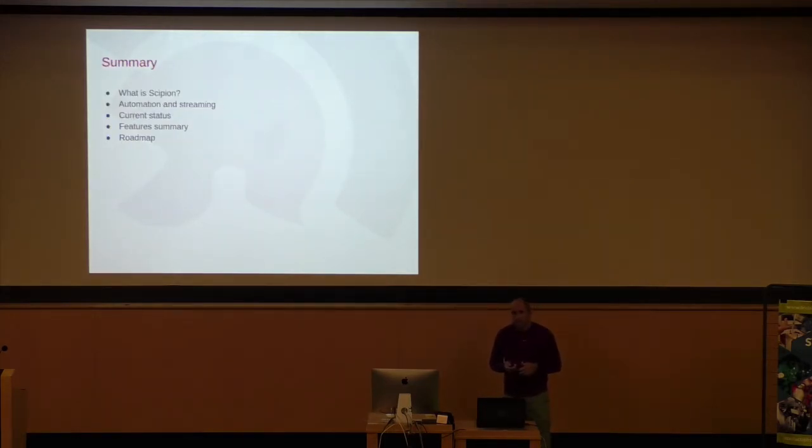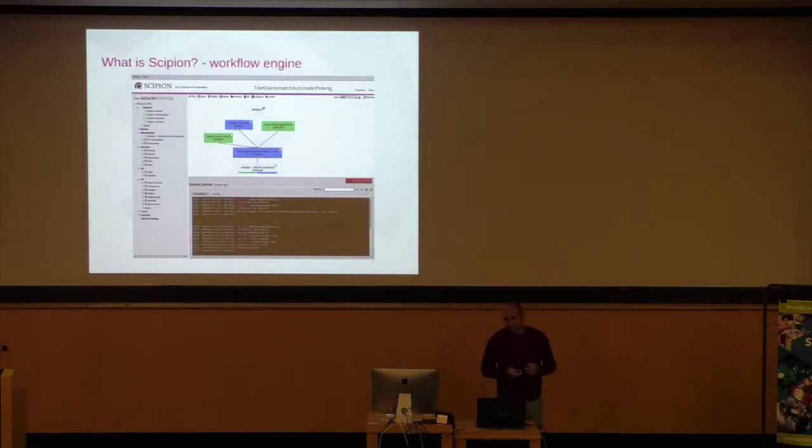Quickly, who knows what Scipion is? Can you raise your hand? Okay. For those that didn't raise their hand, I'm going to explain a bit of what Scipion is. Think about Scipion as a workflow engine.